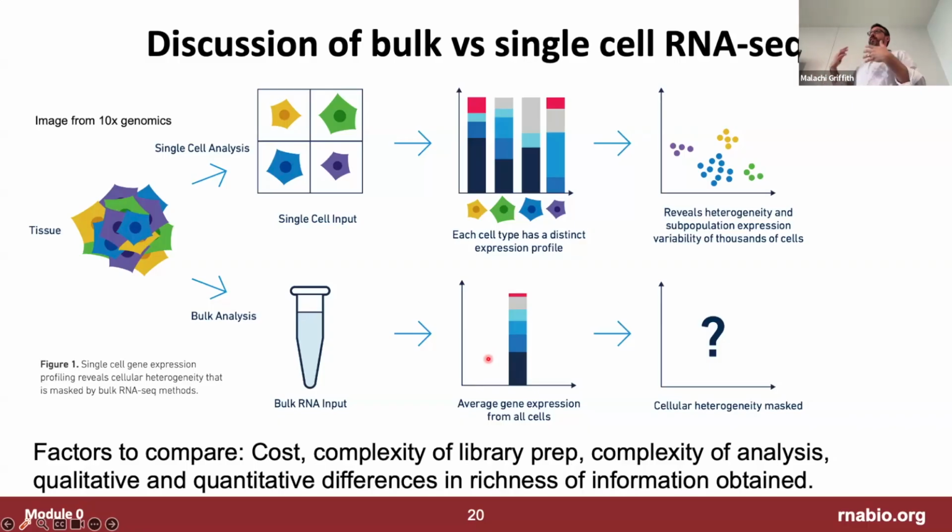You can also try, in the lab, to separate your cells by purifying them or using FACS sorting, other things. That's great. That can work really well, but it creates a bigger burden on the upstream part. And there might be cells that you just don't know how to separate well, or in the process of separating them, it's just more manipulation of your sample.